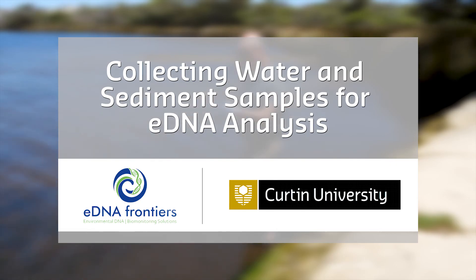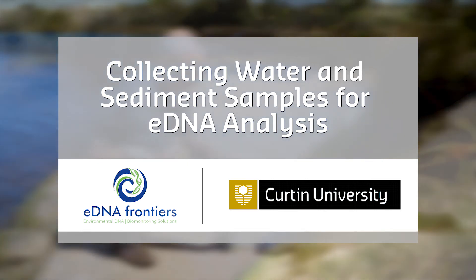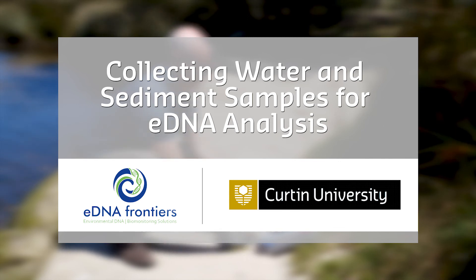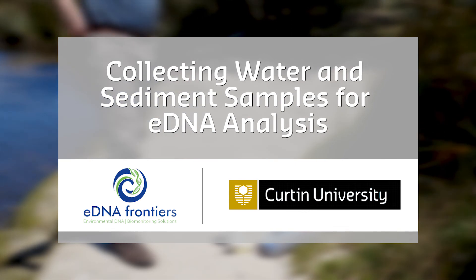Welcome to our sampling video brought to you by eDNA Frontiers at Curtin University, Perth, Western Australia. Here we will describe the basics of sampling water and sediment for environmental DNA analysis. In this video we'll take you through the physical collection of samples, and in the next linked video we'll cover how to effectively filter water samples onto membranes prior to sending them to us.